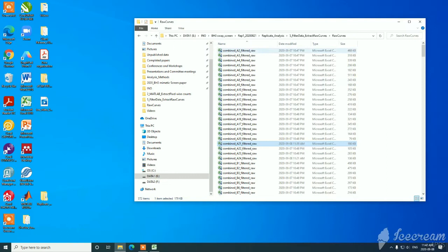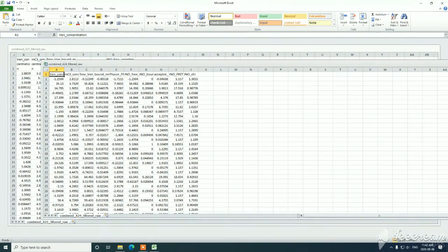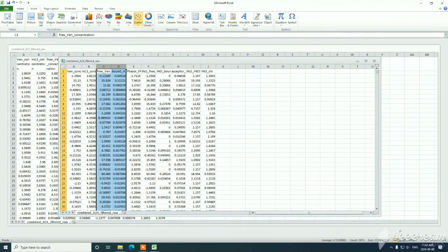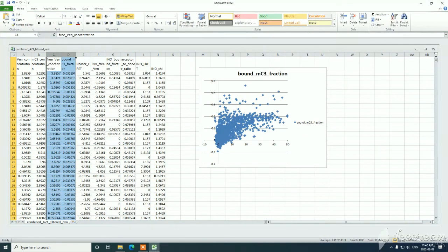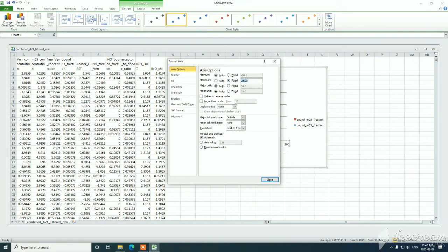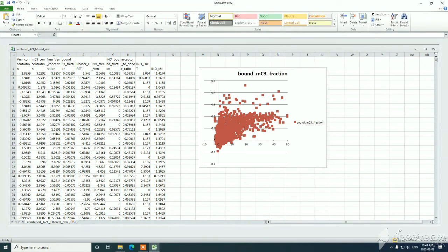If you would like to compare that data set to a negative control for collision, this protein has a mutation in its binding site that prevents binding. You can see that the increase in collisions occurs in a more linear fashion compared to the positive control. So at this point, we've confirmed that we are observing binding for the positive control.